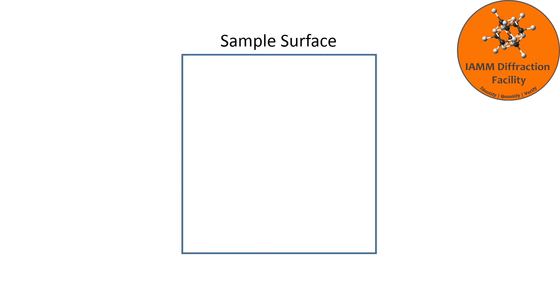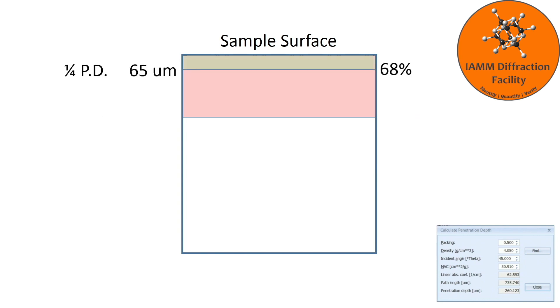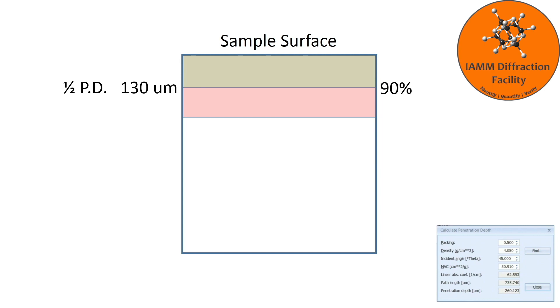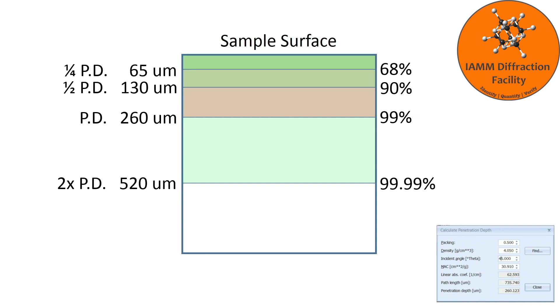Please be aware that the penetration depth does not mean that the diffraction pattern contains information only from that depth. What we see here is that 99% of the information in our diffraction pattern comes from the volume of material that spans the surface of the sample down to the penetration depth shown in the MAC calculator — or 260 microns for our example at 90 degrees 2-theta. 68% comes from the top one-fourth of the penetration depth. 90% comes from the top one-half of the penetration depth. 99.99% comes from the thickness spanning the surface down to double the penetration depth. This means that x-rays are penetrating deeper than the calculated penetration depth, but only approximately 1% of the information recorded in the diffraction pattern originates from the volume spanning 260 to 520 microns in our example.